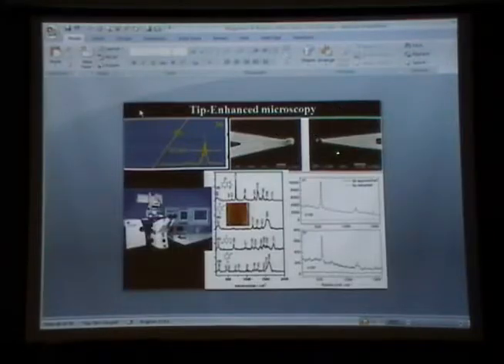But then for example, my optical tweezer, the homemade one, gave me a force of 200 piconewtons. And sometimes to break a protein bond, you need something like 600 piconewtons. If I do not have this force with the optical tweezer, I can use this. That's an AFM image as well. Okay, so you have an AFM on top of your optical microscope, like here, and you can have optical measurements or AFM measurements at the same time.